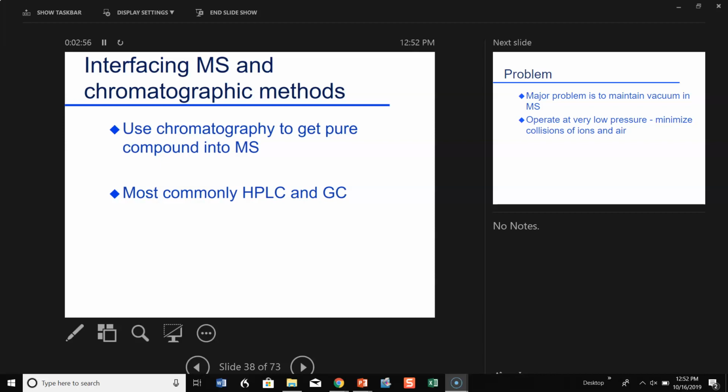My business is flavor, and so I may extract the flavor, the aroma compounds, out of the food. I may have 200, 300, 400 compounds in that. If I simply put that aroma into the mass spectrometer, it would probably blow a fuse someplace, mentally or physically. And so I have to have some way of separating and then looking at one compound after another. And so I work with gas chromatography, I work with aromas, things you can smell. And so gas chromatography is my choice.